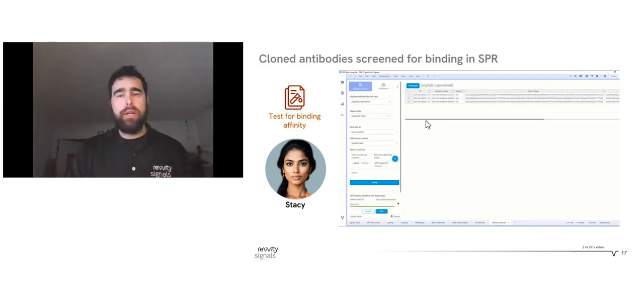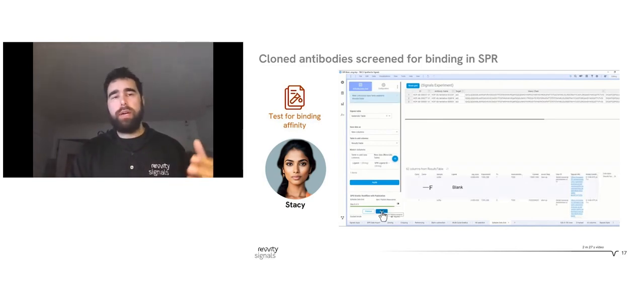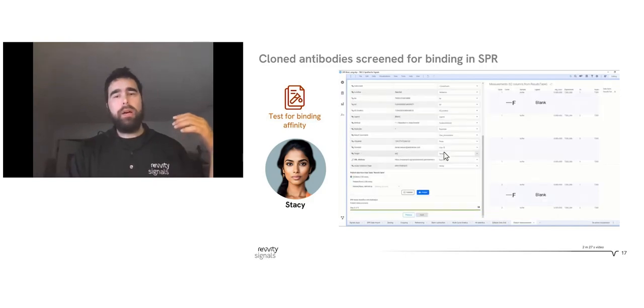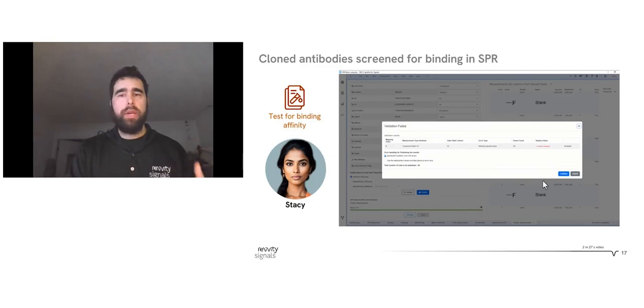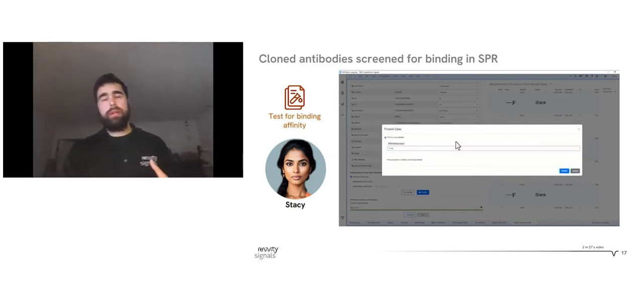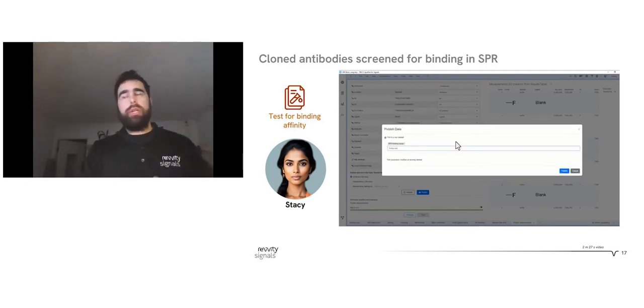That's what we're doing here via the publishing app, which directly pushes this into the data repository layer, to be integrated with other results, and then assess for which of these antibodies will be chosen to move forward, which is what we're doing here.